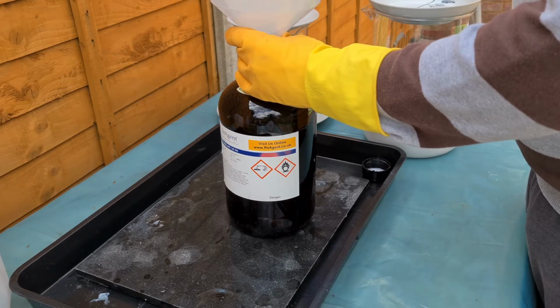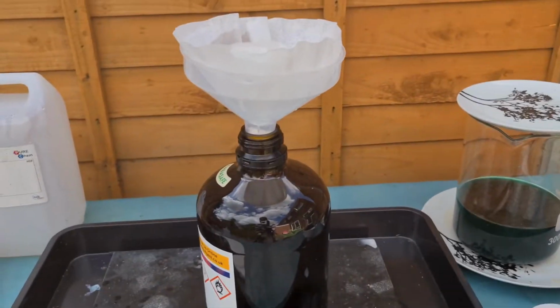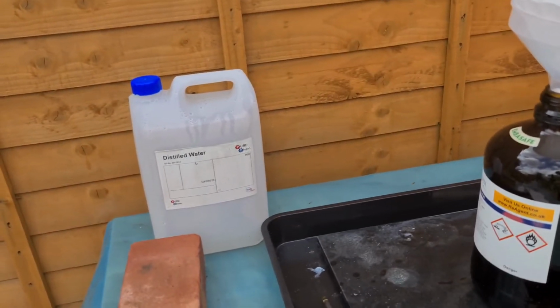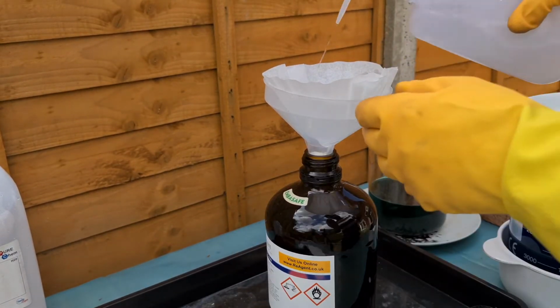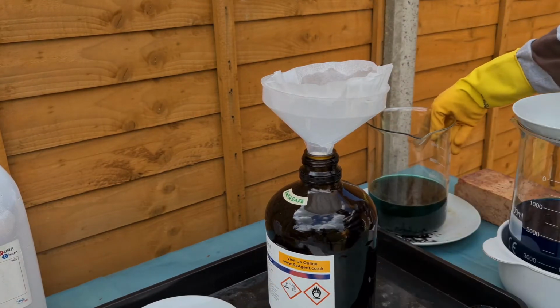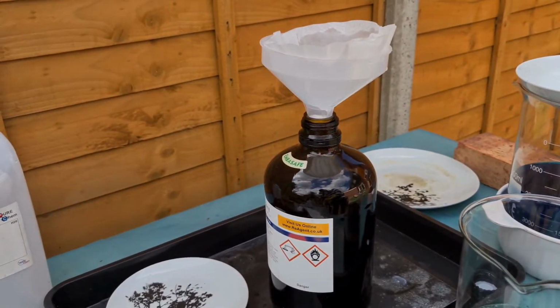Okay, let me actually move the camera around here. Okay, this is going to be hard to actually do. There you go. So I'm going to wet the filter paper down with some water, distilled water, right in there. Then I'm actually going to filter this one. I'm going to filter that solution there into that.